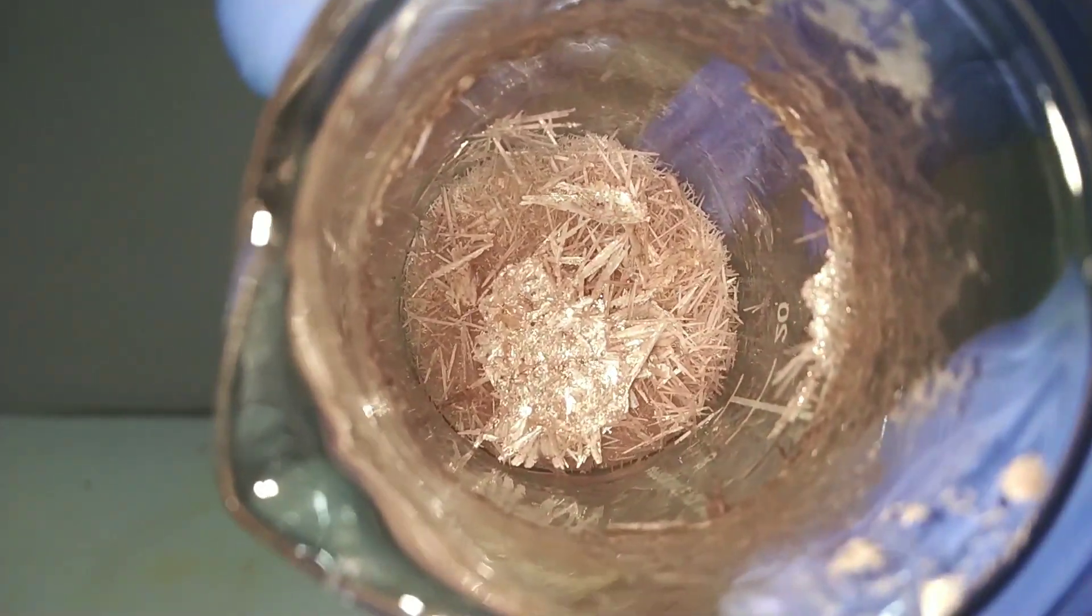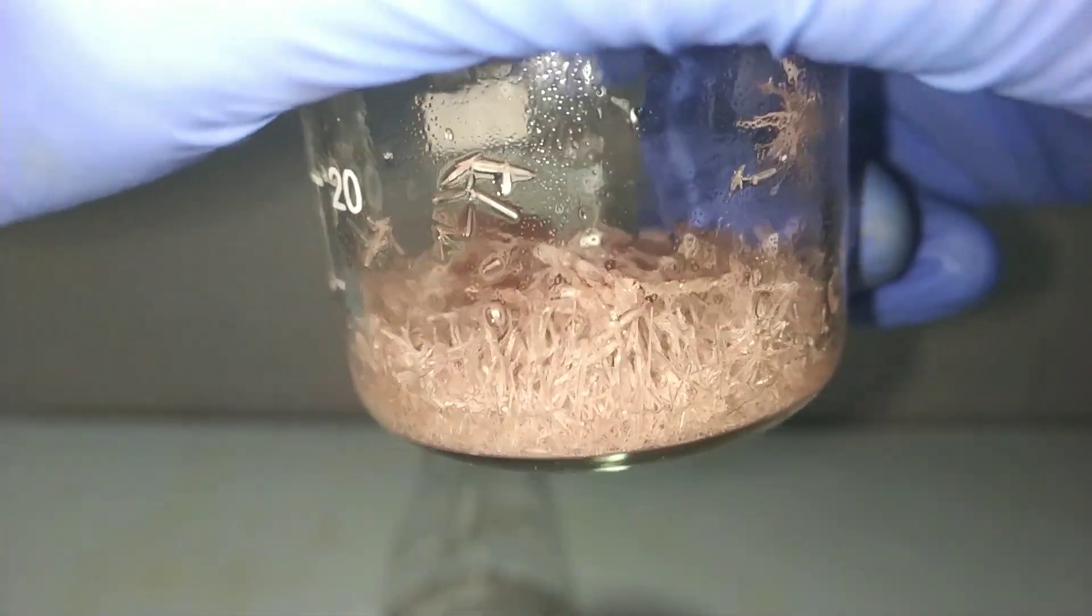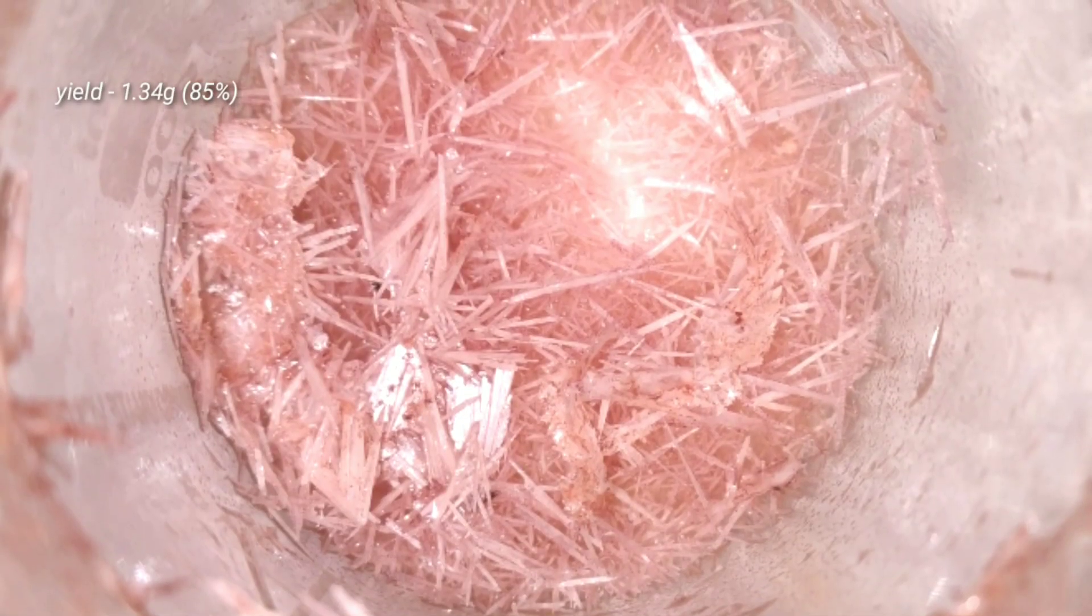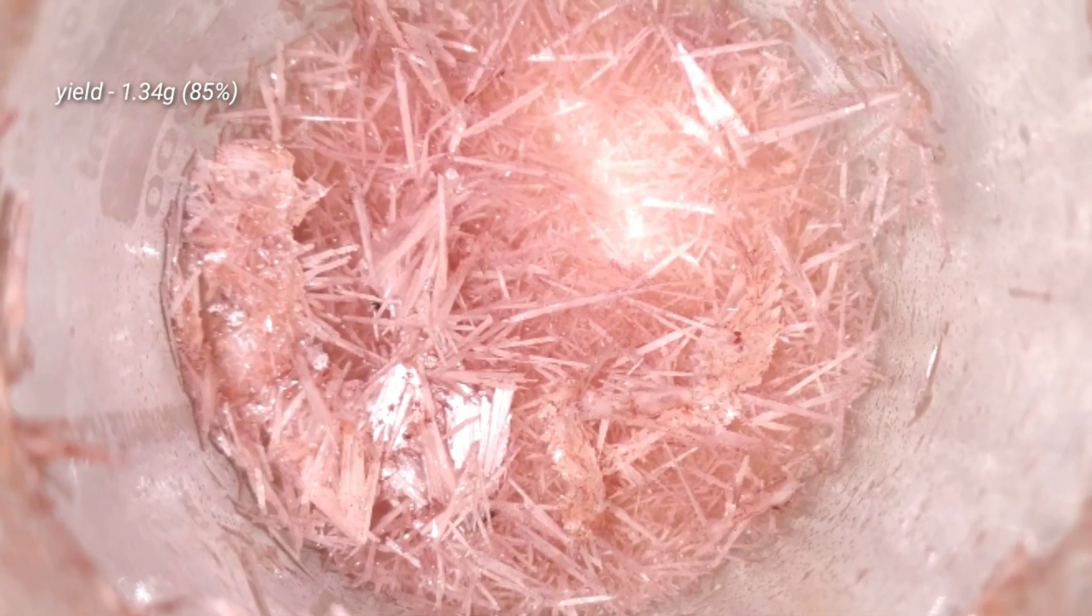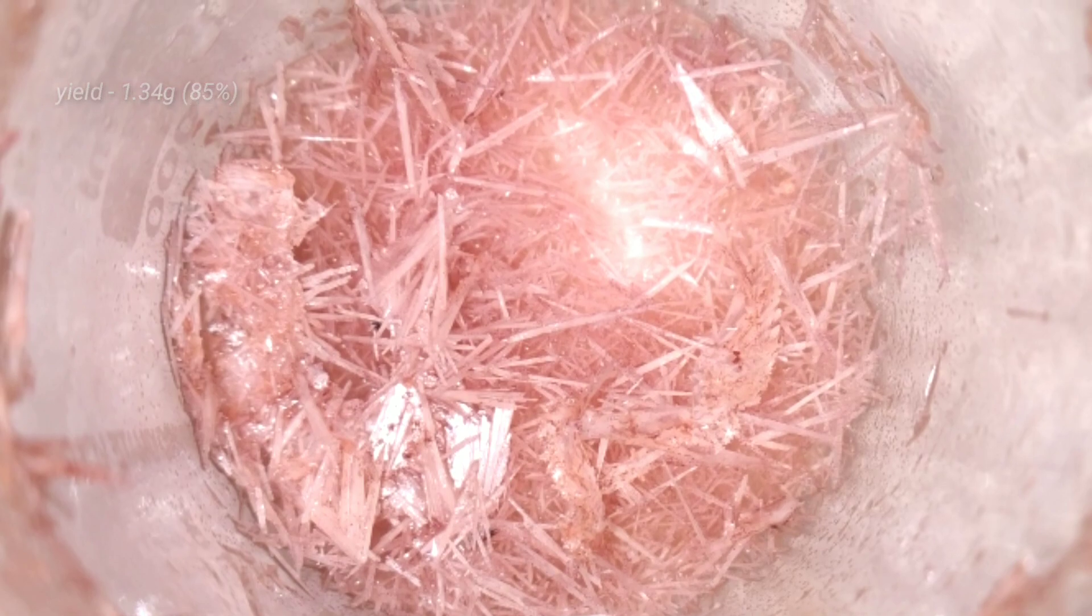And here we have the final product that is the needle shaped crystals of parabromoacetanilide. My yield was 1.34 grams which is about 85% yield.